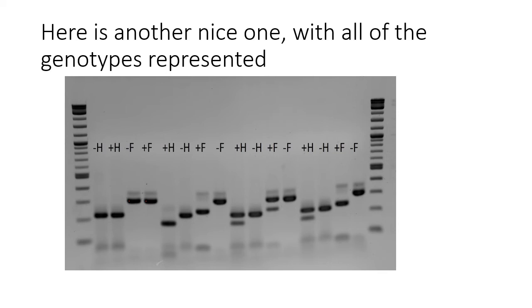The one without the enzyme is 303 base pairs, and the one with the enzyme shifted down, and it's now 238 base pairs. And there's no sign of an uncut product except for those shadowy bands up at the top. So we call this person big T, because both of their alleles appear to cut with the enzyme.